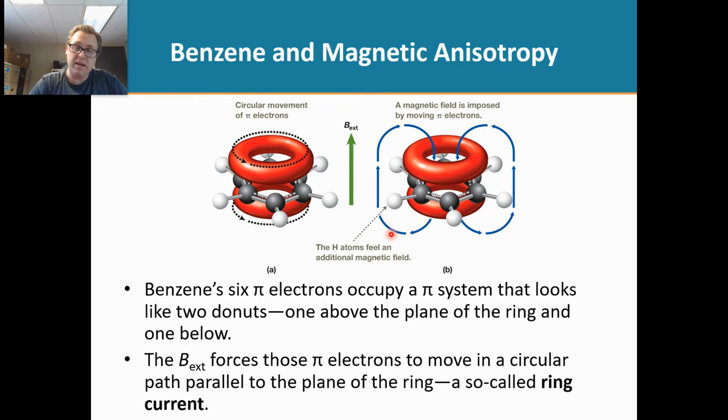And so we generate these magnetic fields right here, shown in the blue arrows. Okay? And so we see that the magnetic fields, let's just start here at my pointer. Do you see how they're going up and then curving and going down into the center of the ring? And it just keeps going like this, right? You see that? So that's what happens.